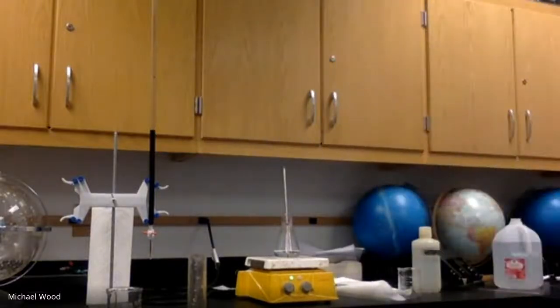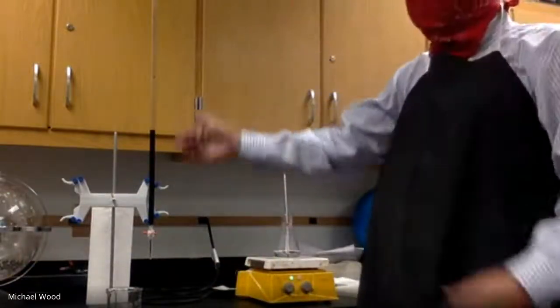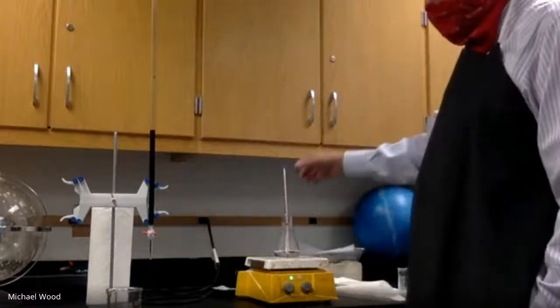They're called a burette, and they're used because you can add a little bit at a time. One thing that's really confusing about these is the way they number them, and you guys will see this next week, but this is a 50 milliliter burette.